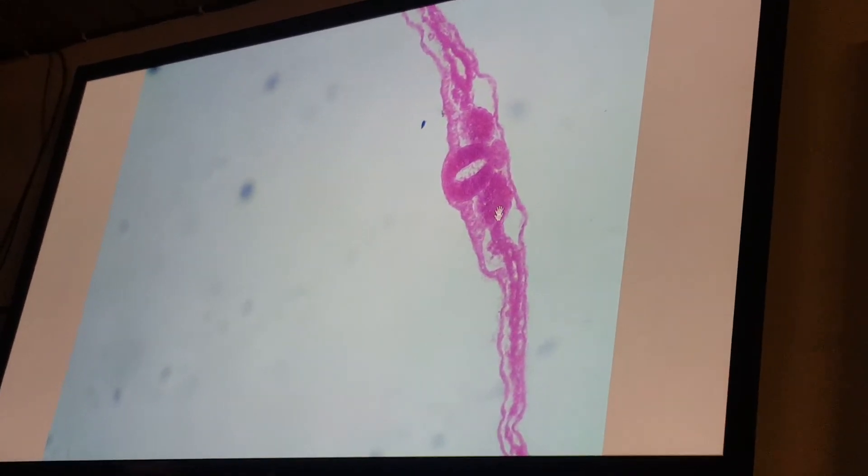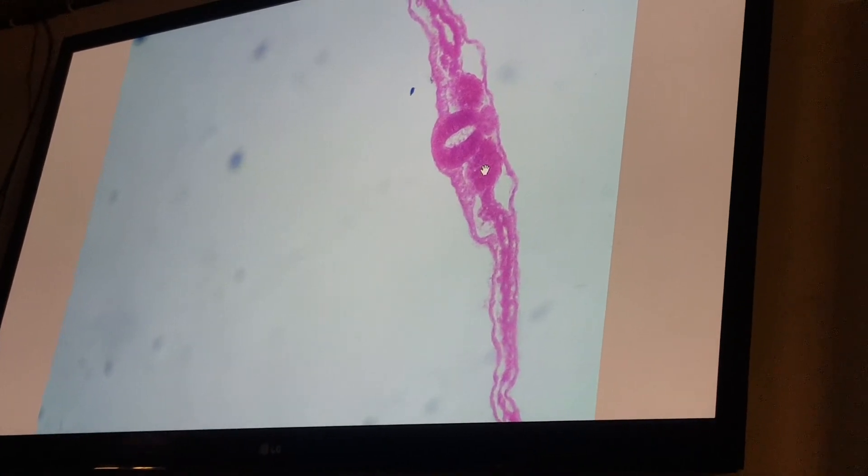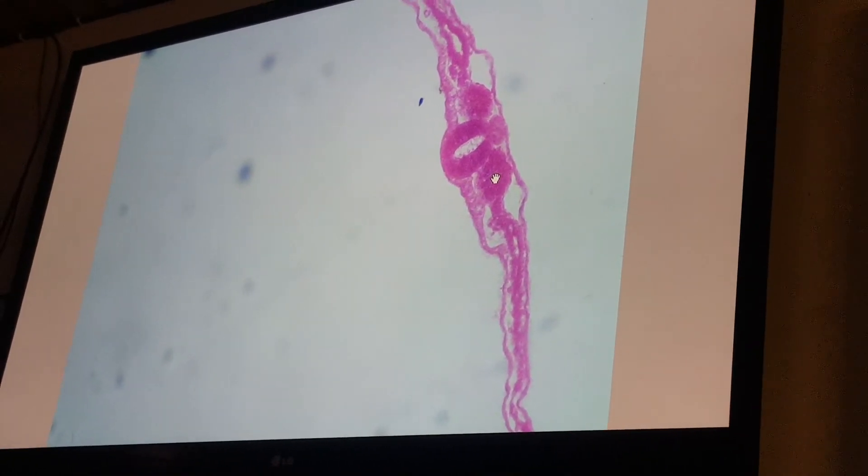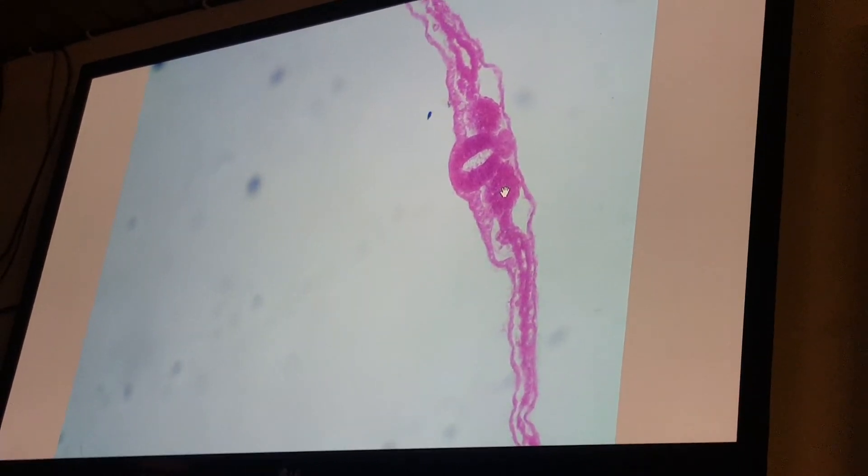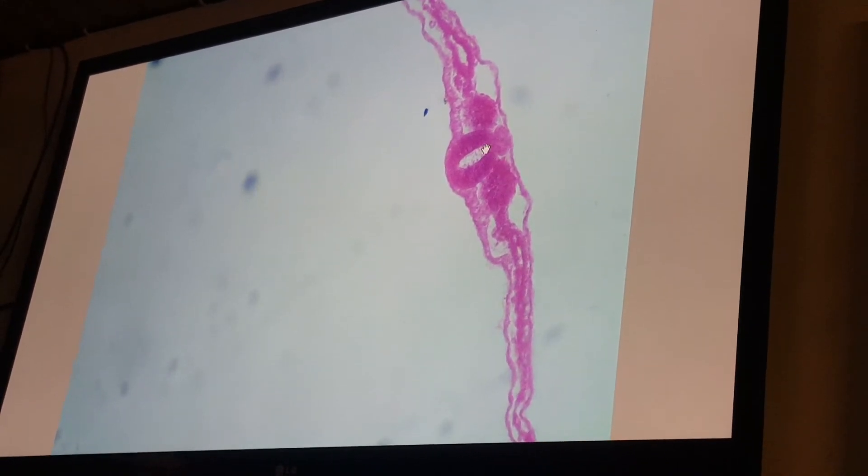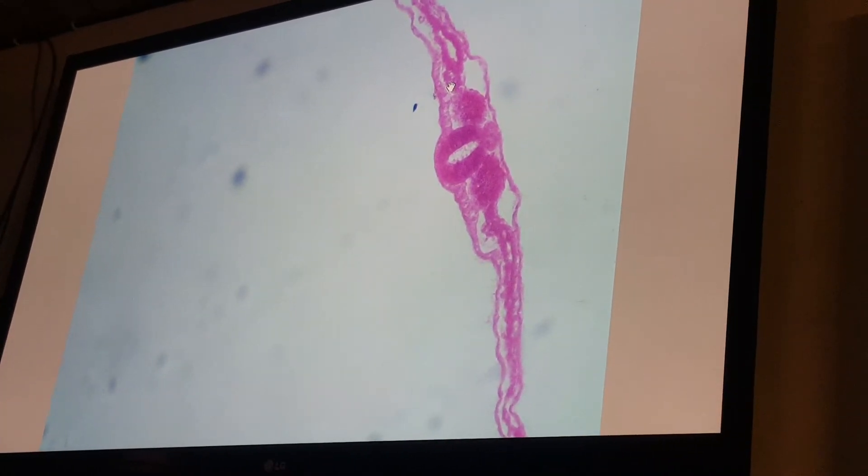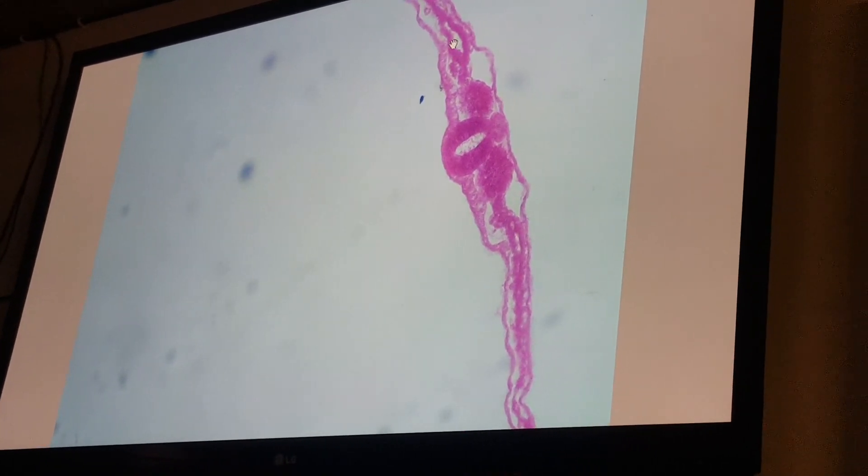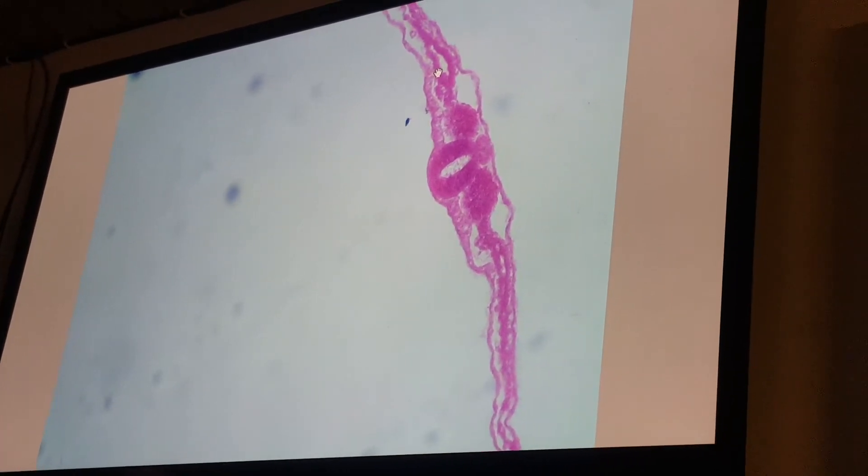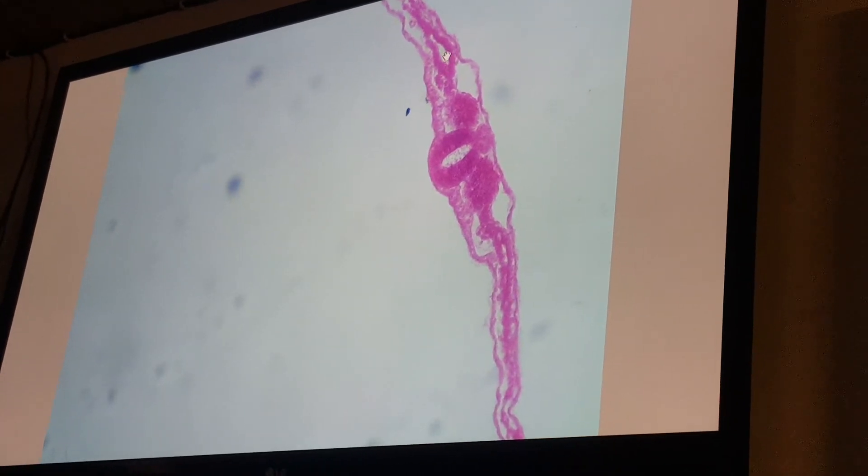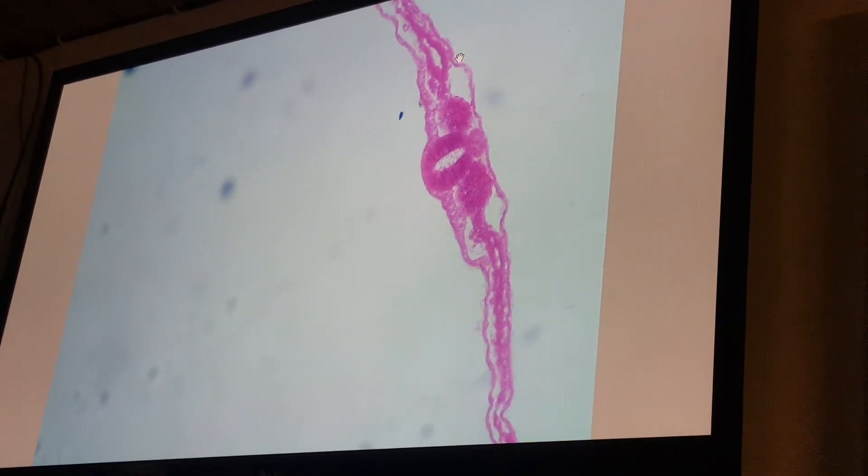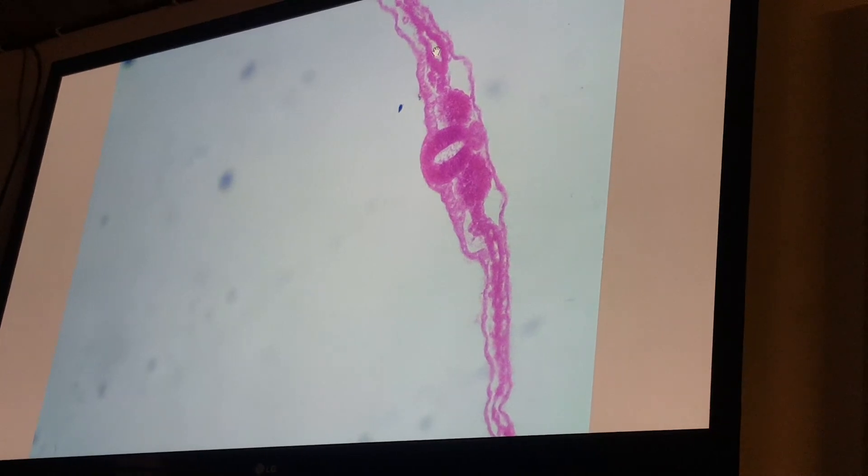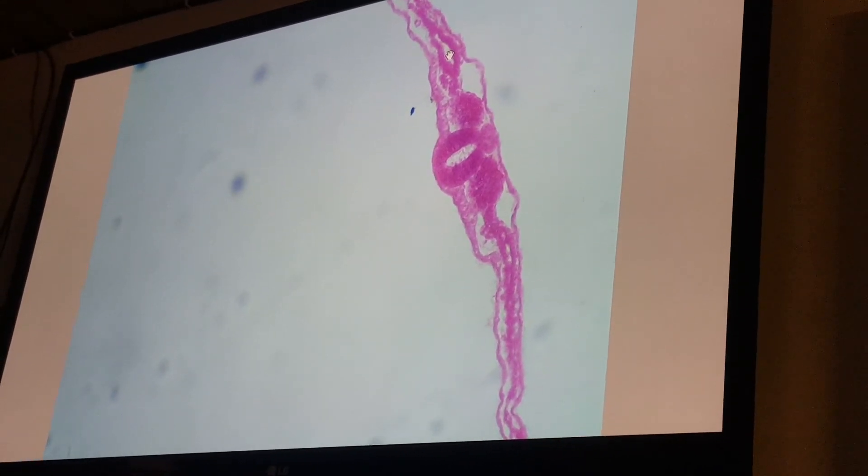Now the paraxial mesoderm forming the differentiated somite. Still, the intermediate mesoderm, the lateral plate, somatic adjacent to the ectoderm, visceral lateral adjacent to the endoderm, and this cavity here, intraembryonic cavity.